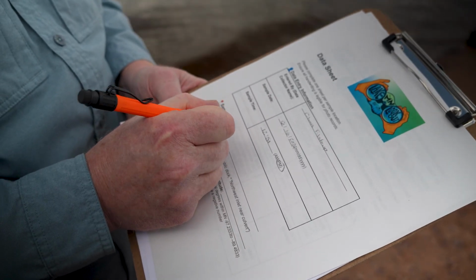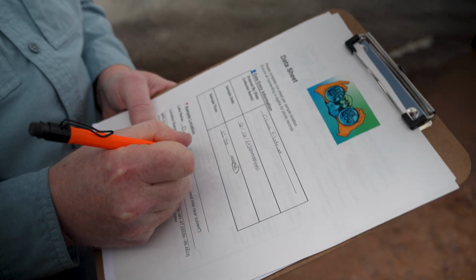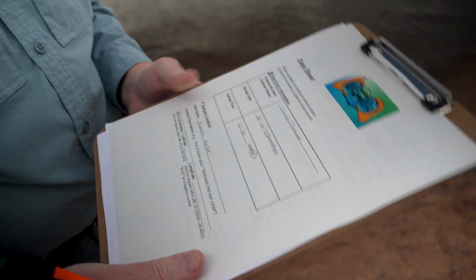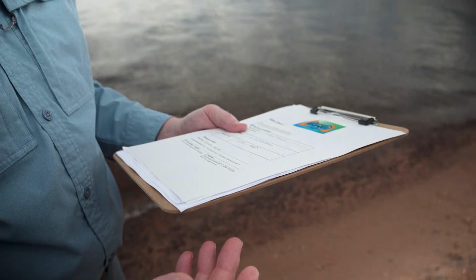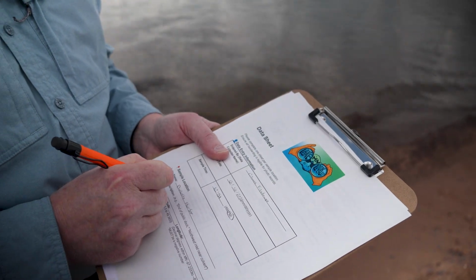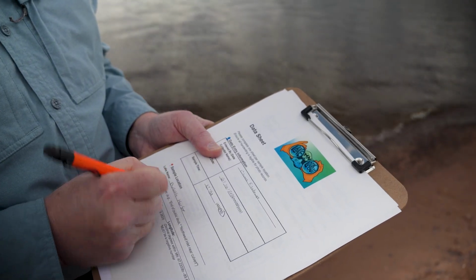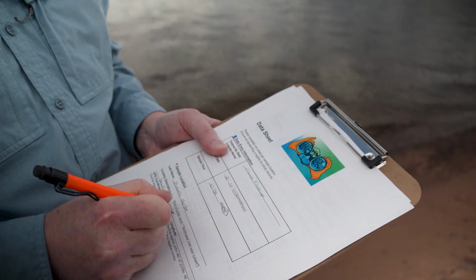So I would write that in, Duluth Harbor. And location description. Right here, I would say that I am at the beach near the UMD boathouse. So we're just going to collect a shoreline sample from the beach at UMD boathouse.